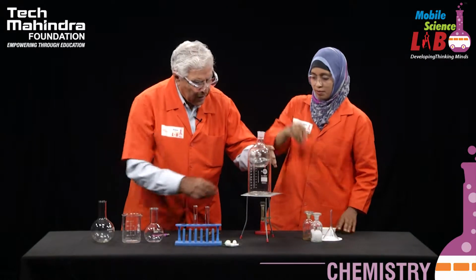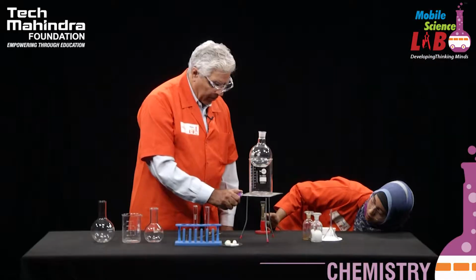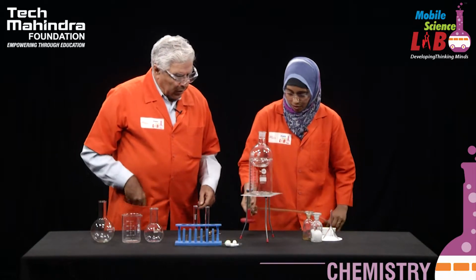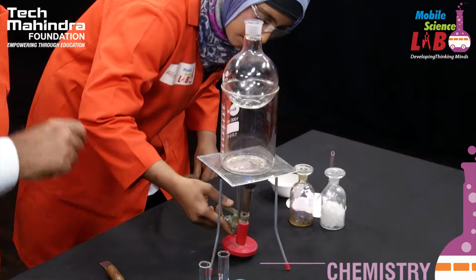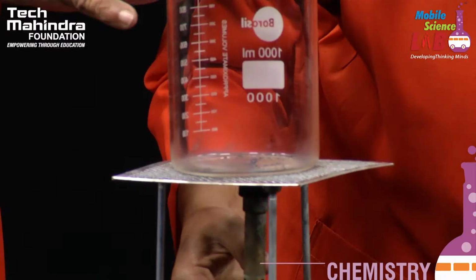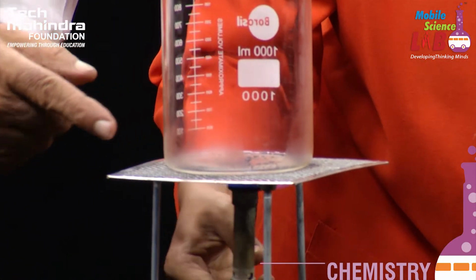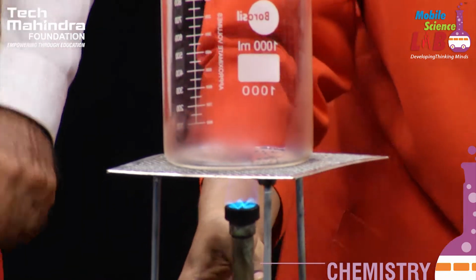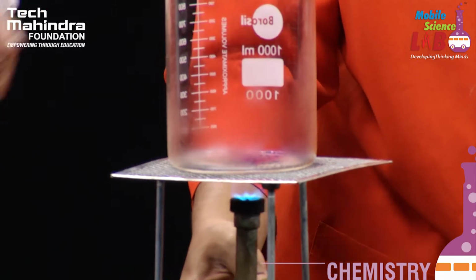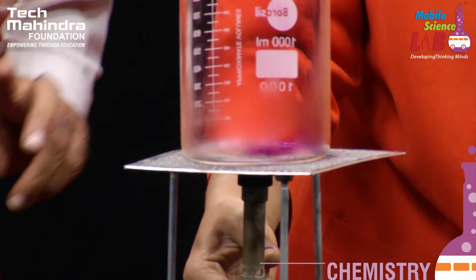Okay, we are going to do it, and now let's start. Now gently move it up and down. Now students, I want you to observe what is going to happen here, and after some time what will happen at the bottom of the flask. Let us see that. As we heat it, you can see some development of purple vapors coming over here.